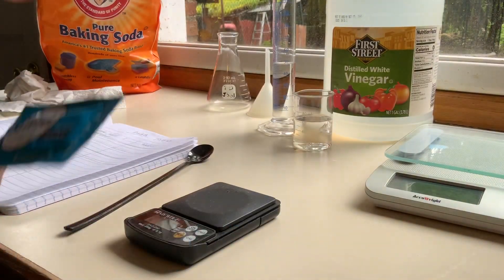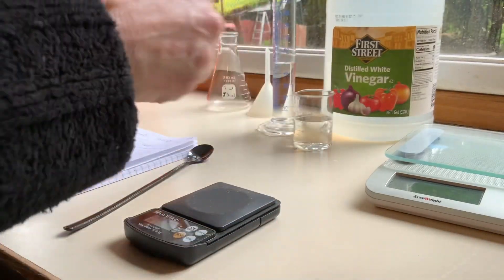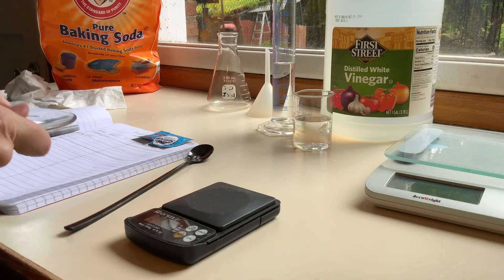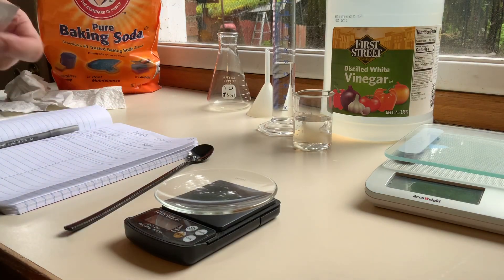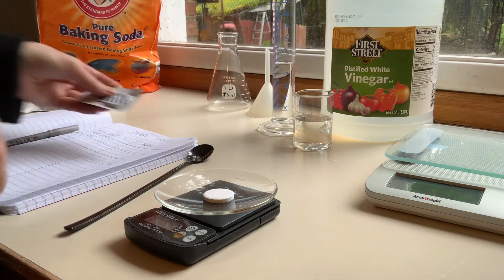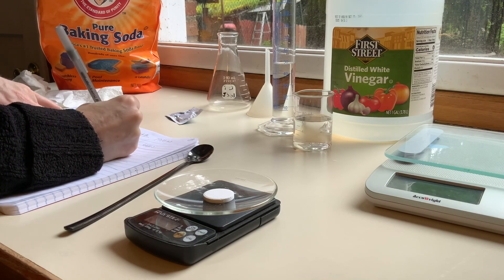It's not so easy to read, let me turn the light on. So we have two tablets and that is the total claim on there. Now I'm going to tare our balance, put the watch glass on it, and then put our tablet of Alka-Seltzer on it. For trial one, that is 58.9 grams.